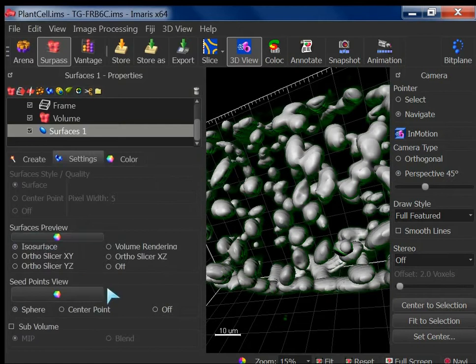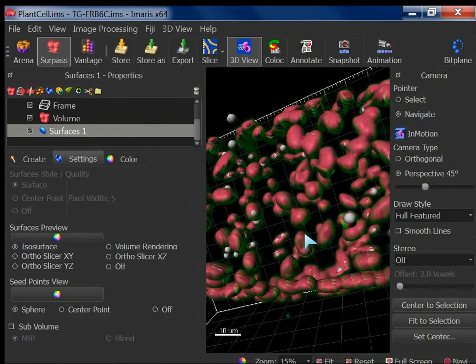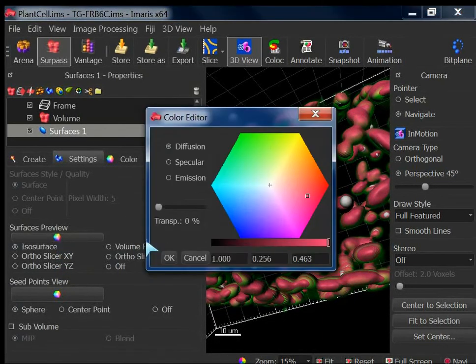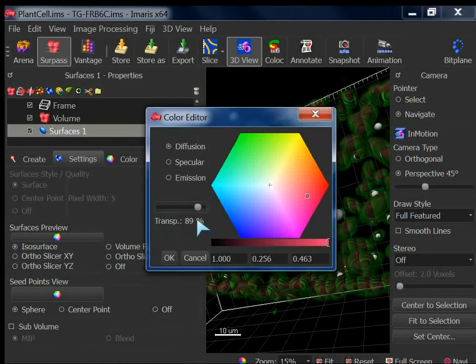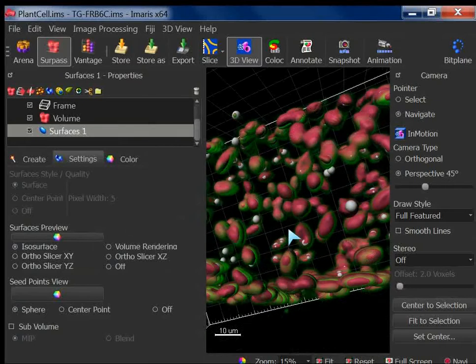I hope it is some. Okay, good. Can you see now? Yeah. Maybe I can change the transparency. Oh, I have to tell you about this transparency, but I will touch that later. Now you can see that.